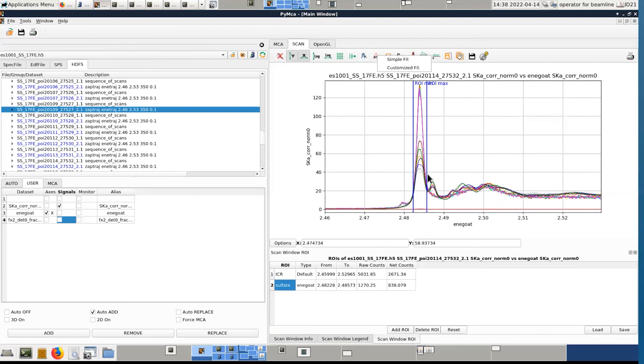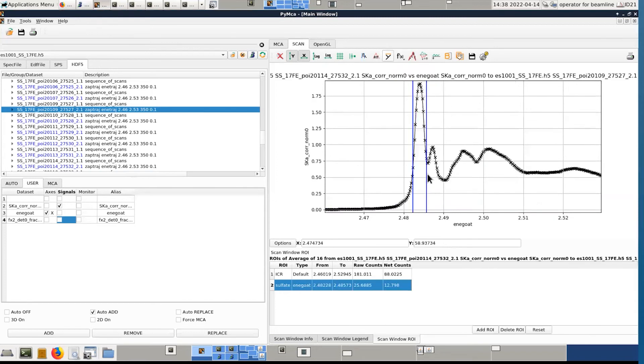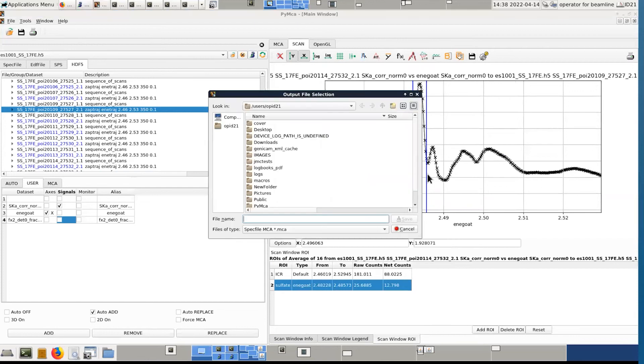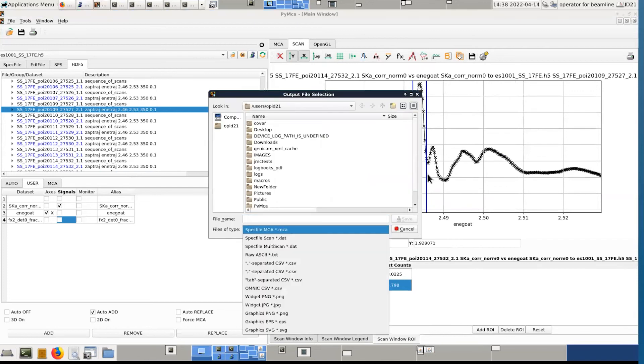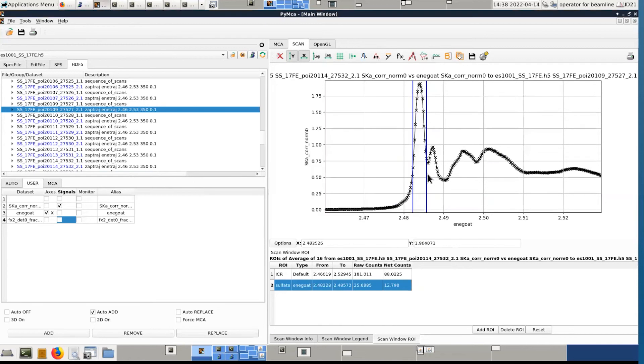Here you have some options for fitting. Simple fitting or customized fitting. This tool is for averaging all the plots which are shown. And then you can save the results of the average again. I would recommend to use the .dat format rather than .dat is like ASCII, two columns, very simple.